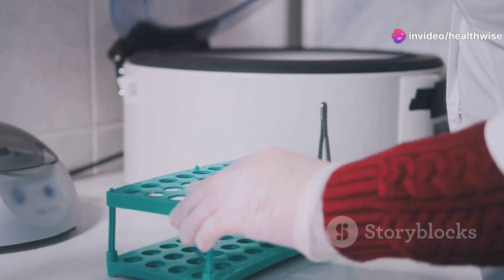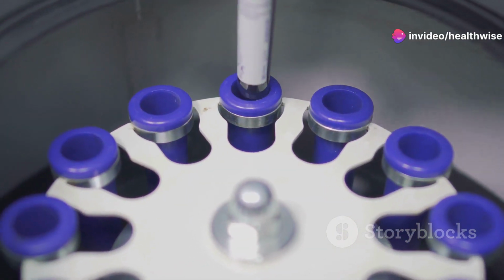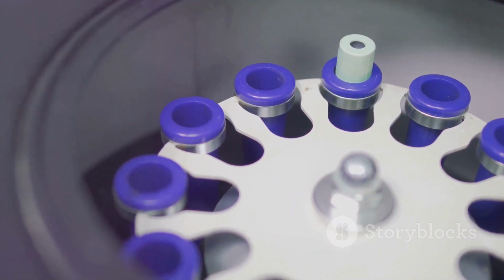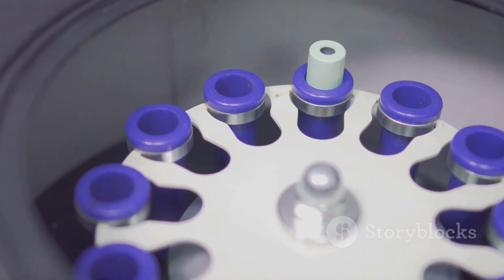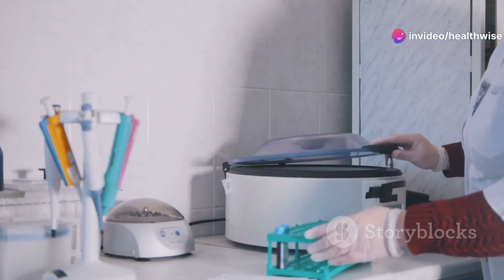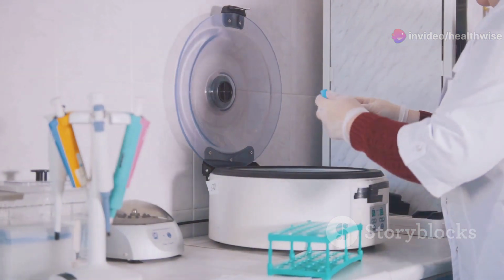Okay, so we know that centrifuges spin, but what's the big deal? Well, that spinning action is what allows us to separate different substances within a liquid sample. It all comes down to density, which is how much mass is packed into a given space. Imagine you have a jar of muddy water. The dirt particles are denser than the water, so they'll slowly settle to the bottom over time.